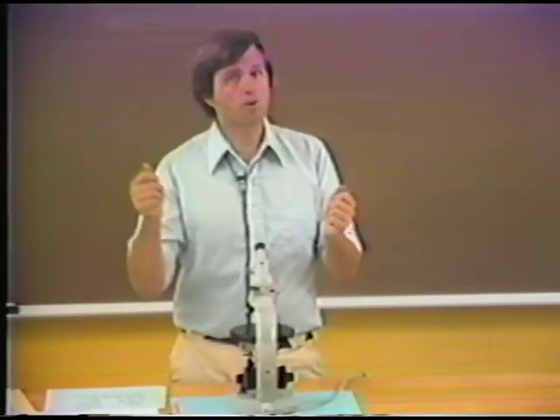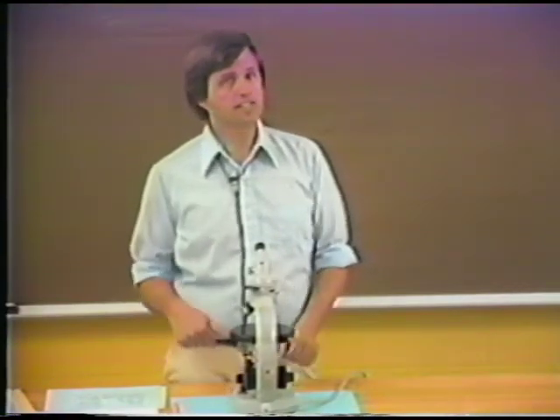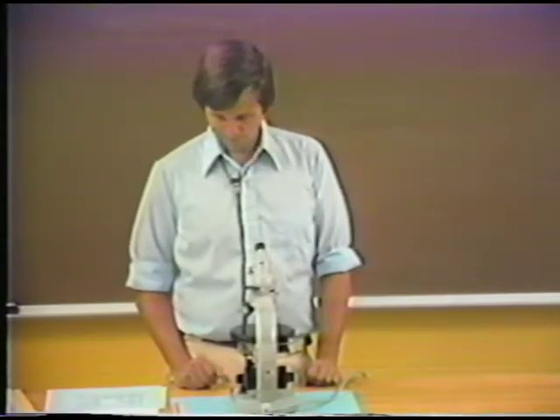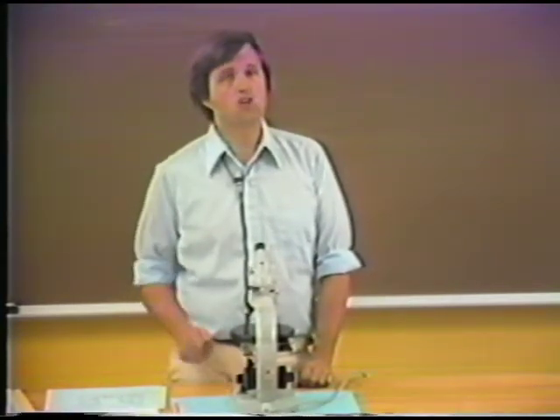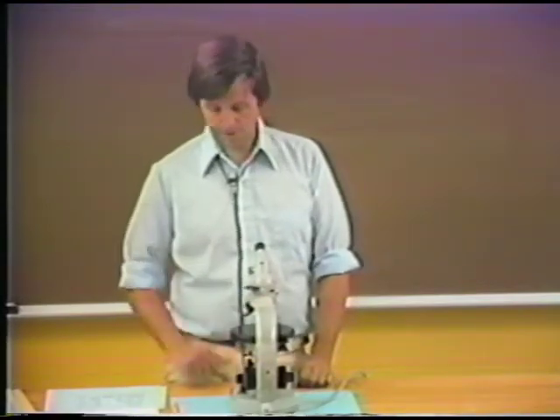which indicates subtraction. So we can determine then the sign of a uniaxial mineral from the flash figure. If we note the position of departure of the isogyres within the figure and use that as a guide to the position of the slow ray of the mineral, I should say the E ray of the mineral, then we can test with the accessory plate to find out if E is the slow ray, in which case the mineral is positive, or if E is the fast ray, the mineral is negative.